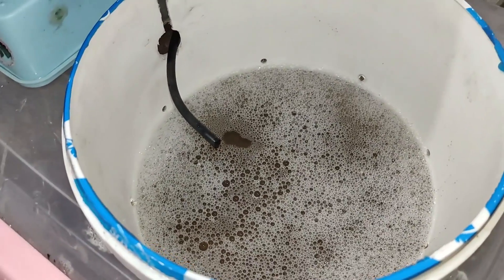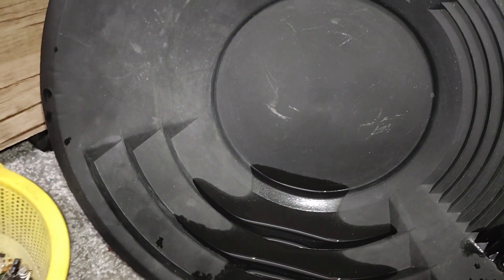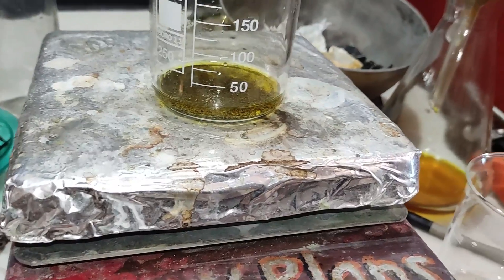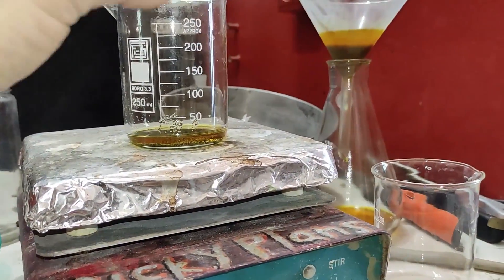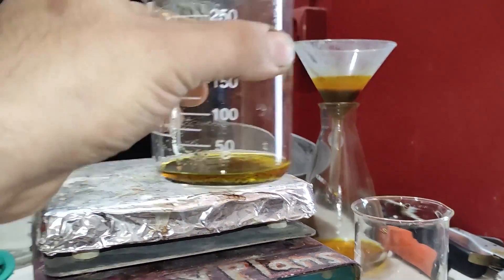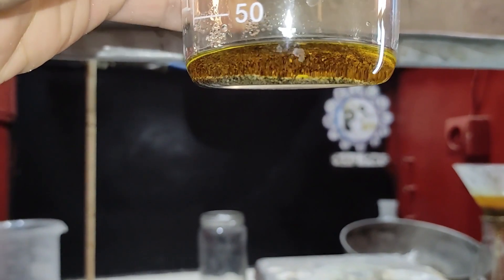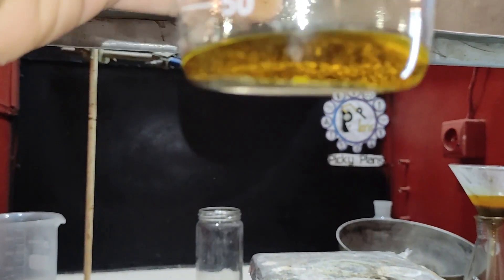I transferred everything to my gold pan and got a clean powder with no trace of iron sulfide remaining. I then placed it on the hot plate and made some aqua regia. As you can see, there was still some trace of iron sulfate which changed the solution color, but the majority of the powder is black sand and other regular material.